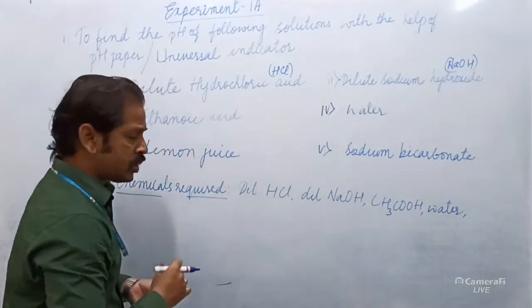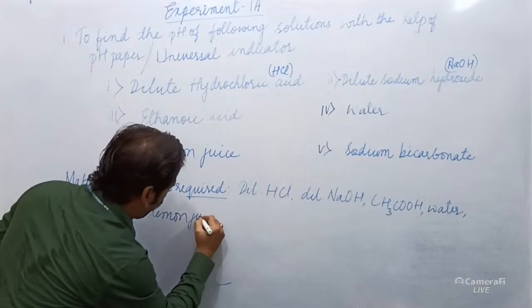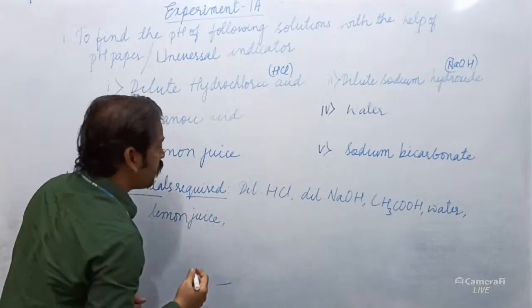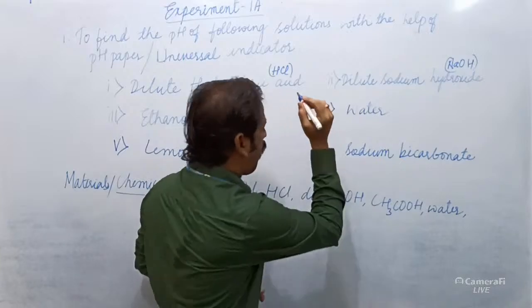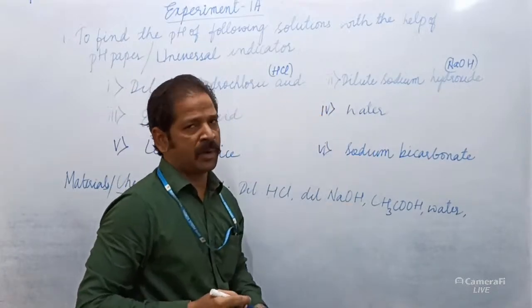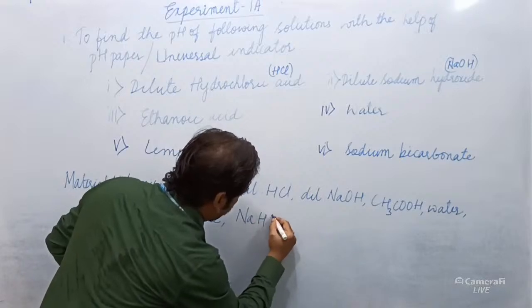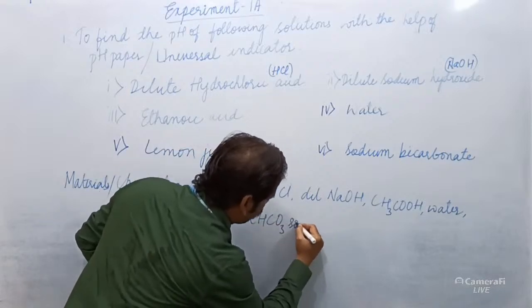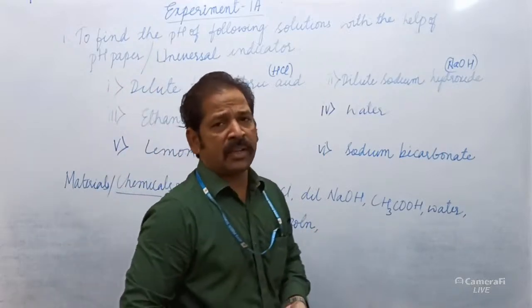Fifth is lemon juice. Sixth is sodium bicarbonate solution. These are the chemicals required.